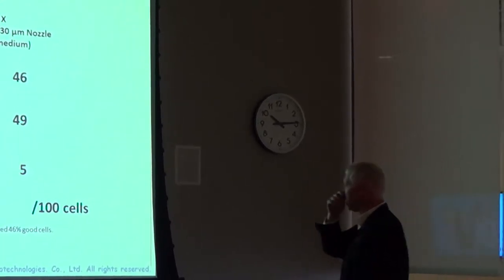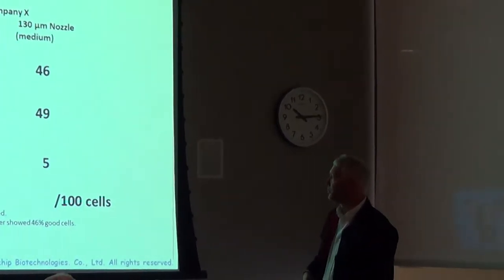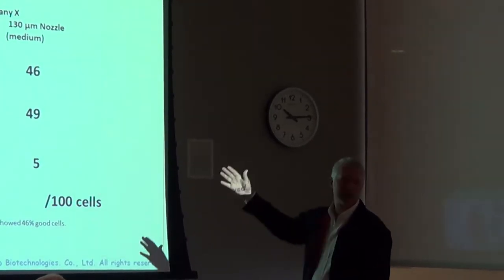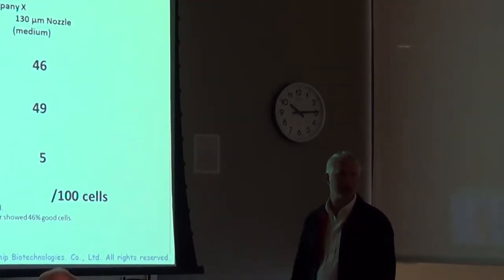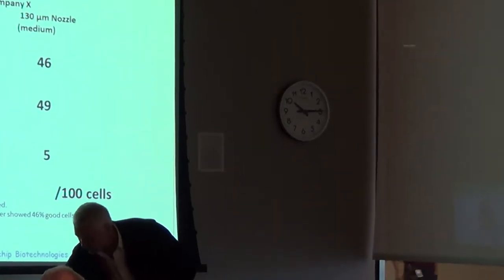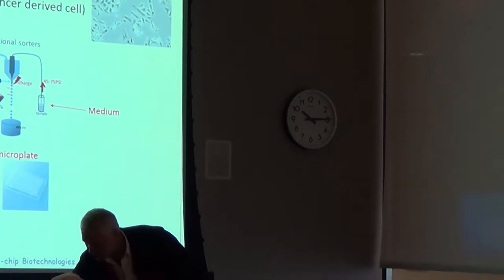So this is a pretty interesting slide. We're still seeing from 3x to 10x better, depending on how you view these numbers, in terms of viable recovered cells.